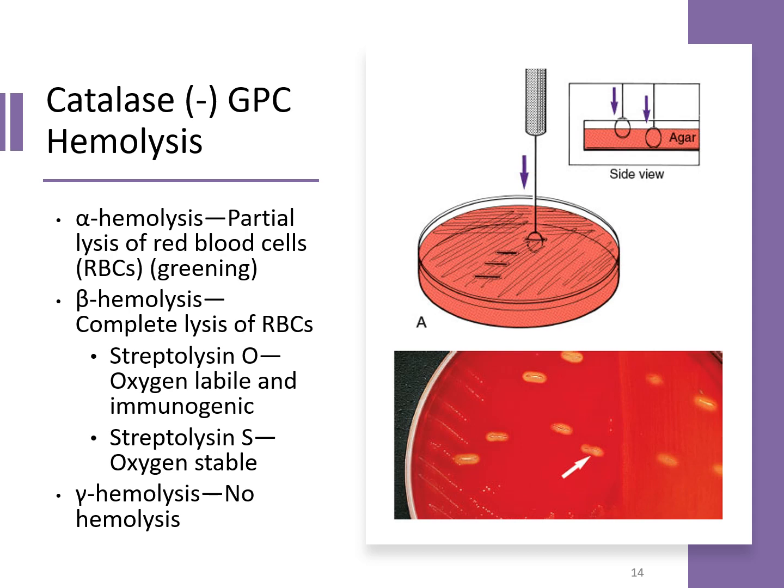What happens here is that it allows for the detection of streptolysin O. Streptolysin O is an oxygen labile virulence factor that is produced by Strep pyogenes, and it works best when it's not in the presence of oxygen. So when you stab that agar plate, it gives it an anaerobic type environment to grow in.